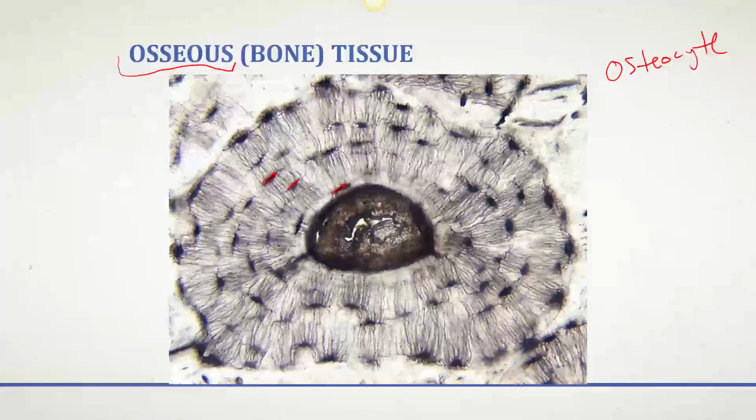And this time, when this osteocyte gets trapped inside of the matrix that it's sprayed around itself, it has these little tiny channels known as canaliculi that bring nutrients from this central canal. This is not where you have bone marrow. This is where you would have blood vessels and a nerve supply. So nutrients from here travel through these little tunnels, and you can actually see the tunnels. They're like these black squiggly lines to provide nutrients to all of these osteocytes that are trapped inside of the bone tissue. So they have a direct line to nutrients and waste exchange.